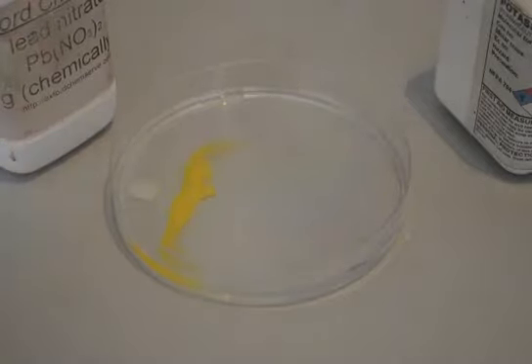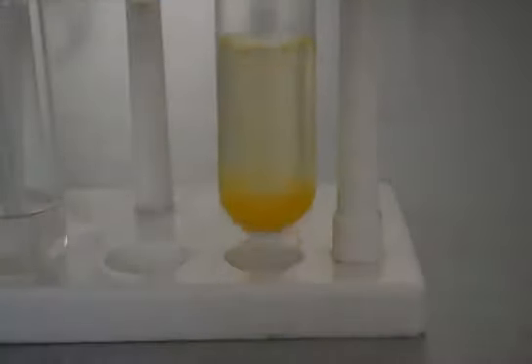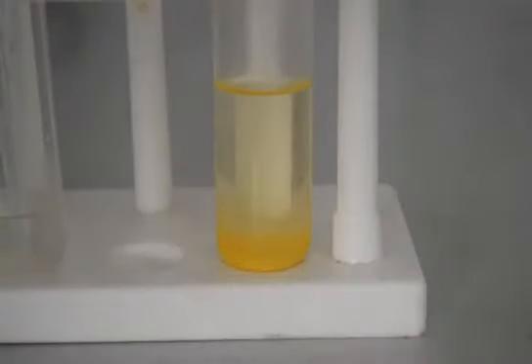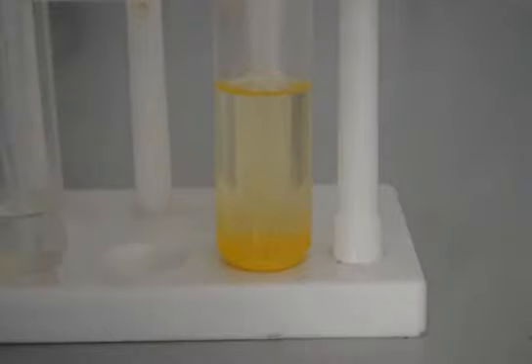We've now waited a few days for the lead iodide precipitate to settle down. So you can see there it's all settled at the bottom, and we've got the clear liquid above. So it then gives me a chance to take some small drops of the lead nitrate and we'll drop it into the potassium iodide, and then we can see the reaction occurring in very small bits.